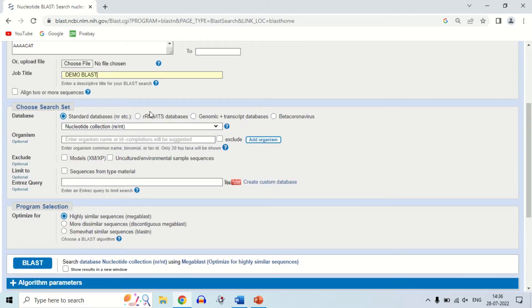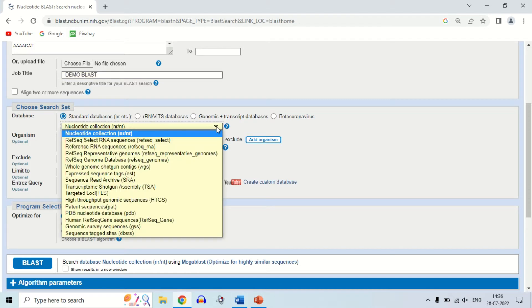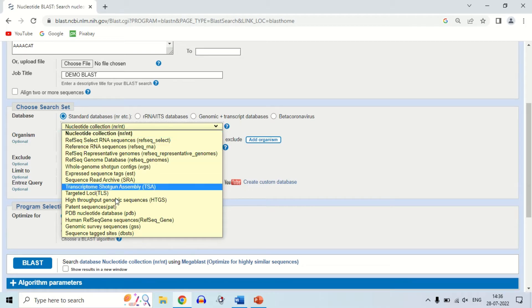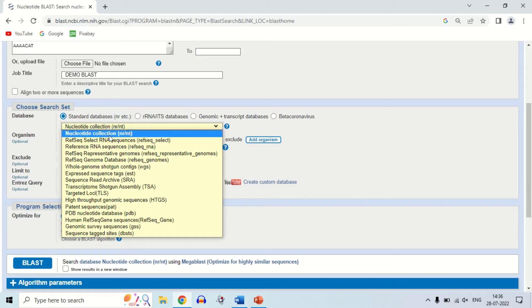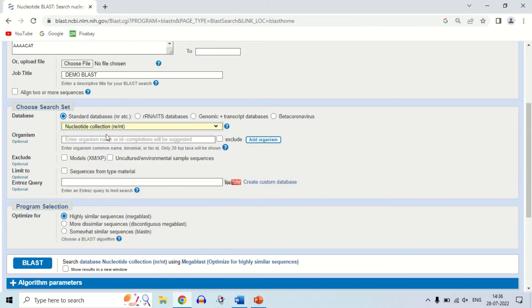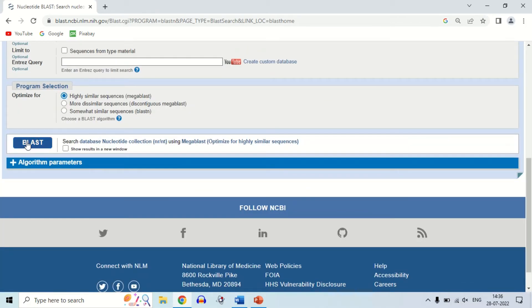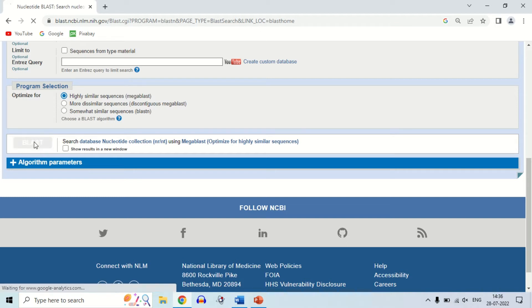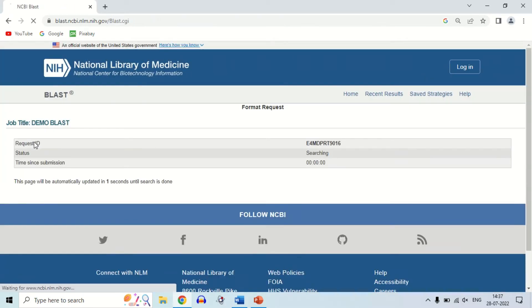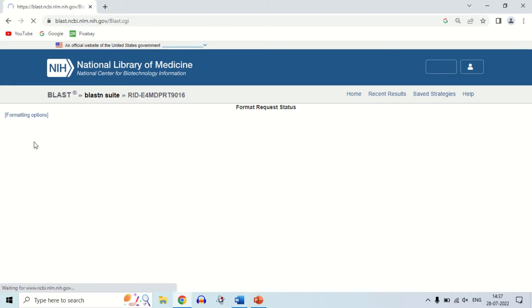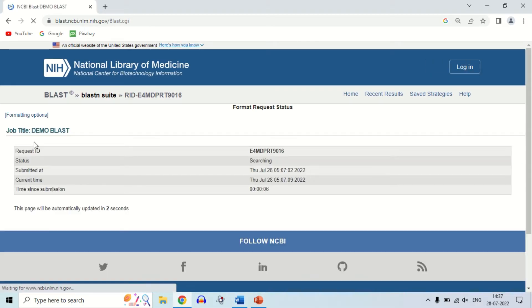In the next option, you have to choose the database from which you want to compare your query sequence. The nucleotide collection database is the standard one selected. If you click here, you will see many databases to choose from. For demo purposes, I am choosing the nucleotide standard collection database. You can also enter the name of an organism if you know it, or leave it blank as it is an optional field. Once you have filled all the boxes, click on the blue BLAST button. It may take some time depending on the size of your query.